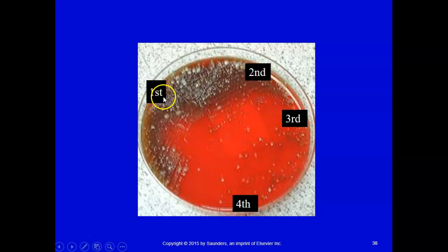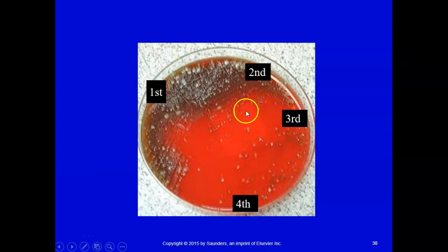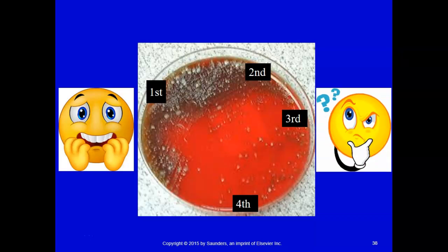So they went into the first quadrant a lot. Okay, so you can see very concentrated, then slightly less concentrated, and then we can see the bacteria being pulled out to the third quadrant, and then finally the fourth quadrant. So when you first see this, you might think, oh my goodness, I'm afraid of this, I don't even know where to start. But then we start to ask the questions. What sample is this? What pathogens am I expecting?